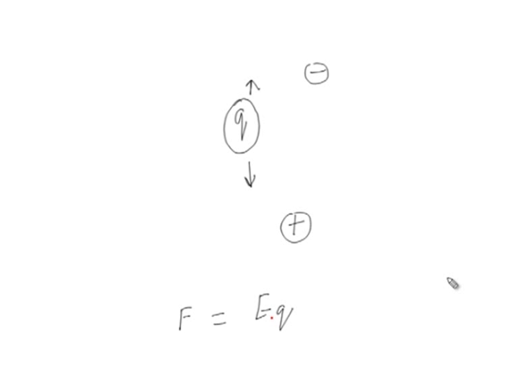Now, there is another force when a particle moves, like we were talking about size and shape here, that is frictional force. That frictional force will oppose the motion of the particle as it moves through a particular medium.